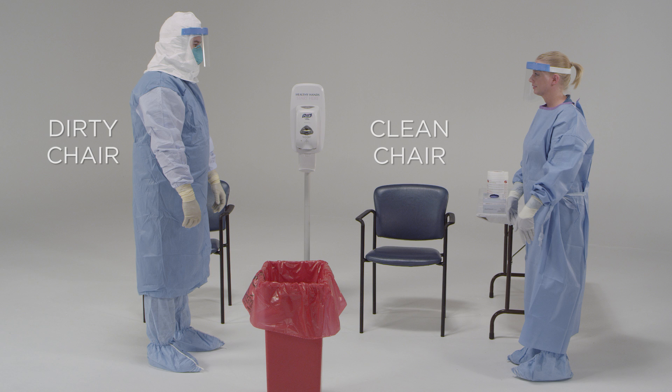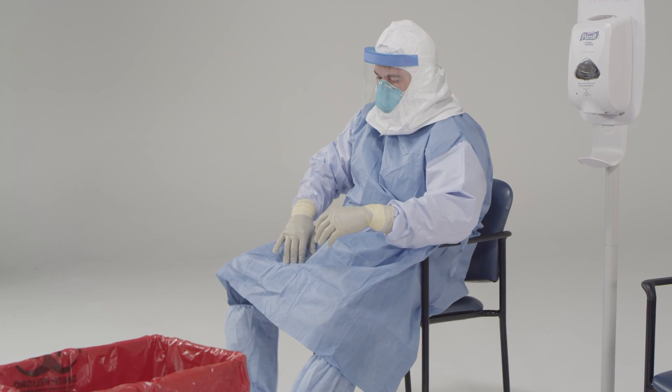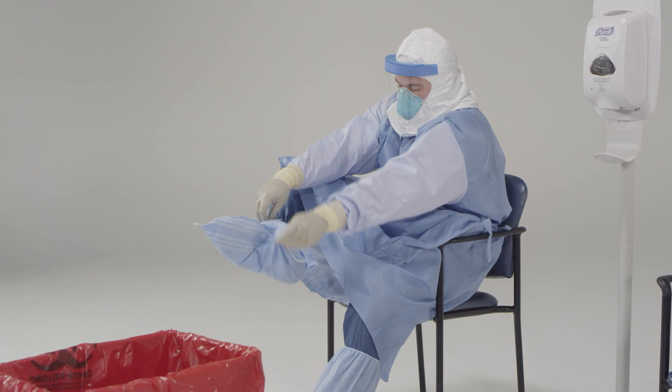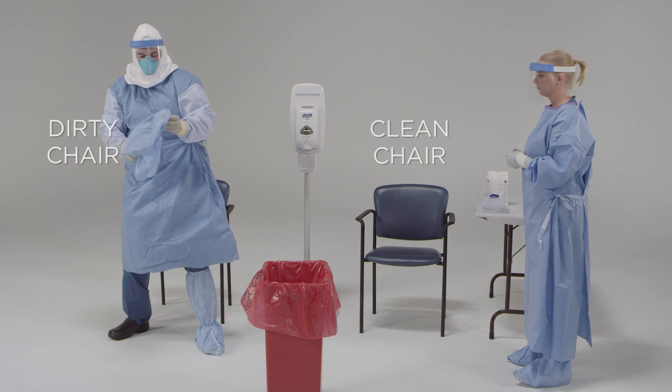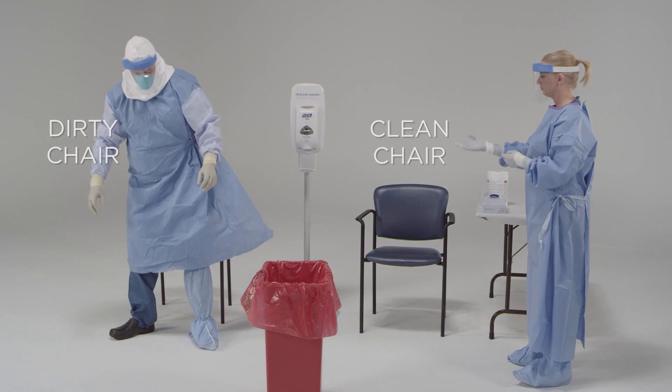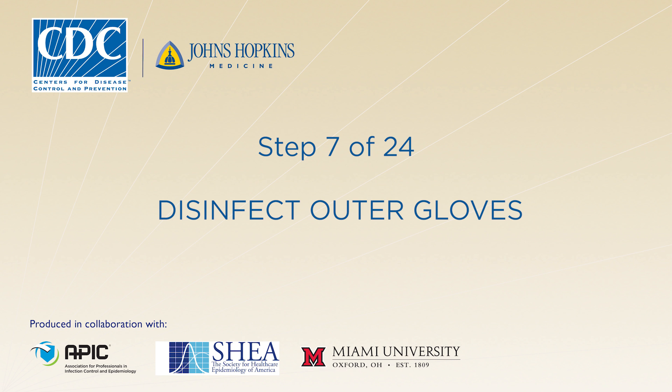In your doffing area, you will have two chairs. One will be where you sit to take off your boot covers only — this chair will be marked clearly as dirty. Once you sit down, be careful not to touch one leg with the other. Then, grasp the outside of the boot cover and pull down toward your ankle, lift the boot cover over your heel, pull it off your foot, and dispose of it correctly. The exact way to remove the boot covers will vary based on the manufacturer's instructions. Now it's time to disinfect your outer gloves again.